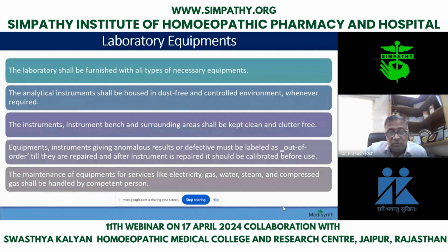So of course it will seem to run fine. You can't see it, but if you check the total solids, they become very high. That is why every 3 months or 6 months you have to change the filters. And the AMC people will come. They will check the quality of the water, and accordingly they will act.